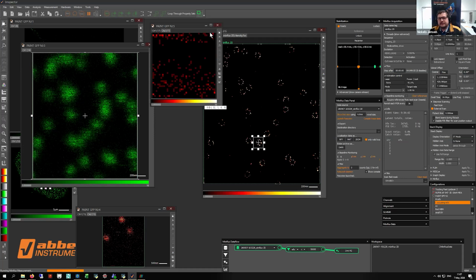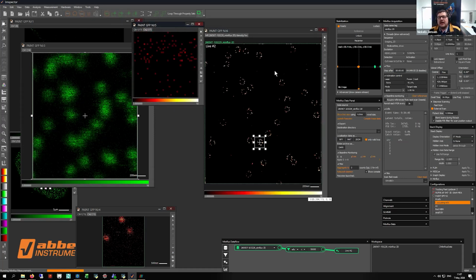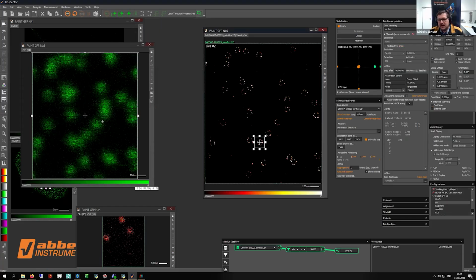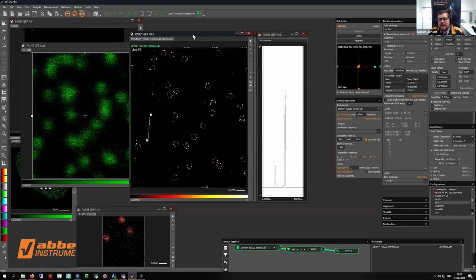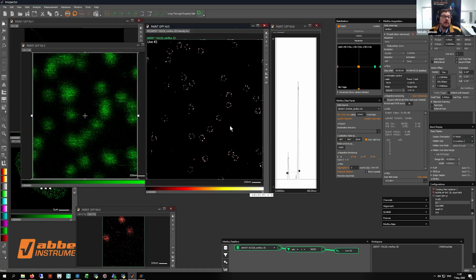So, perfect. Now I stop the measurement. And as you can see here, you see all the nuclear pores very well resolved. They have a diameter here. Sorry, you can directly check with the line profile the diameter of a nuclear pore. And then you can see that it's exactly those 110, 105 nanometers between the upper and the lower ring of the nuclear pore.